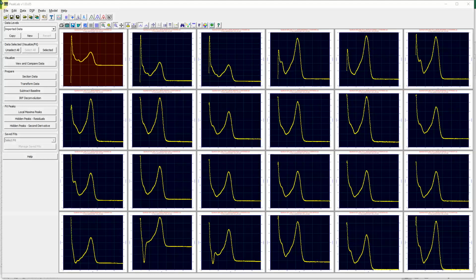In this exploratory UV vis spectral modeling, the solvent solution for the spectroscopy is the actual mobile phase of the chromatography. It's a very fast, very efficient way to see if the UV vis liquid spectra can be readily used to estimate chromatographic or other laboratory reference values.